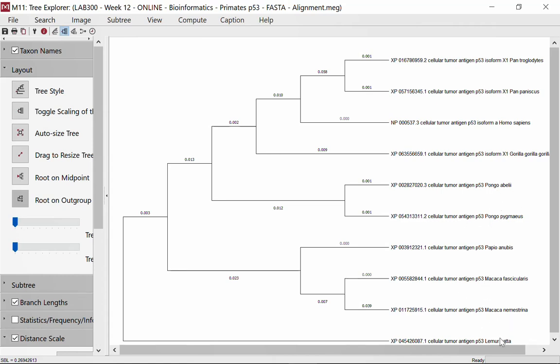Okay, so as I was mentioning before, the lemur, in the primate order, at least those that you are analyzing, is the one that split the earliest compared to all the other ones right here. And I was pointing to you how baboons and macaques here are actually much more closely related. That's where I was showing those three different amino acids compared to the other one. So orangutans, sorry, that's what I was talking about here. These are different species of orangutans, part of the same genus Pongo. Okay, sorry, my brain is completely fried by now. So I'm actually going to stop right here.